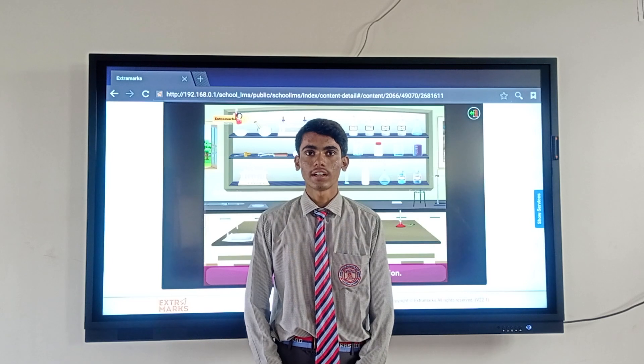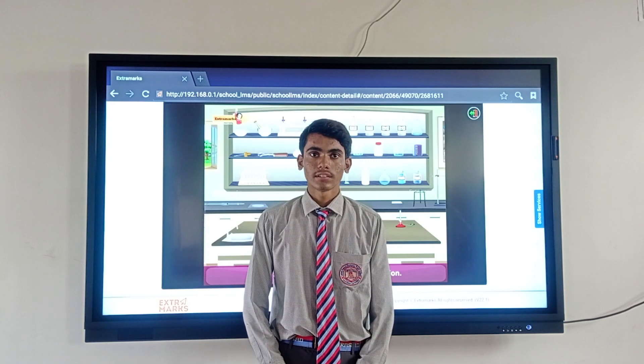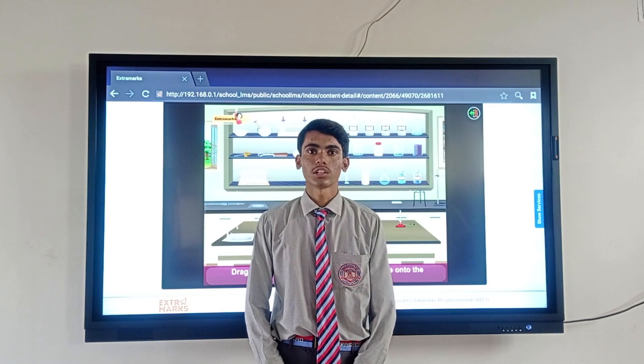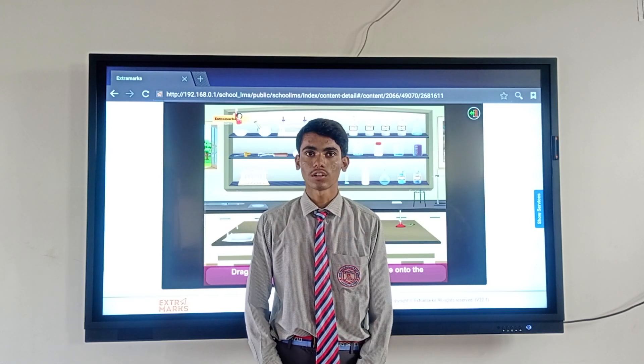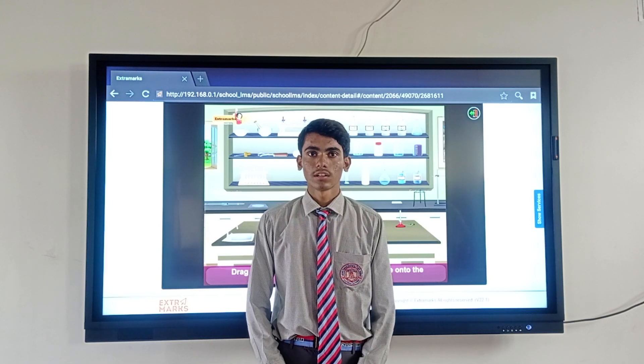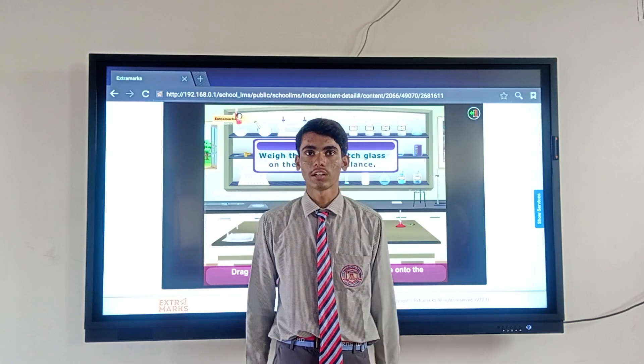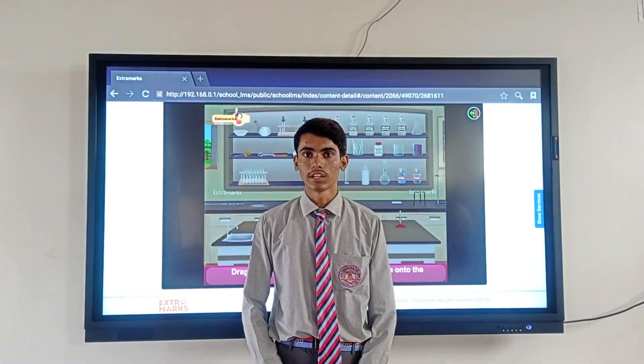Stand, burette, stand, pipette, burette, wash tube, conical flask, volumetric flask, solution of potassium permanganate, solution of ferrous ammonium sulfate, and Mohr's salt.